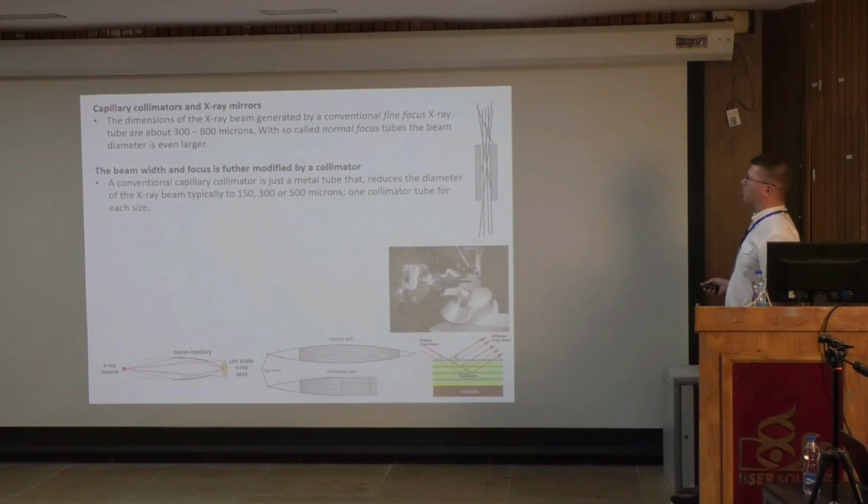But then the other one is that you can also do a new technique. You can use mirrors and collimators like this. So here the X-rays are coming from that side. Now, by moving and changing the spatial orientation of these two things here, they will also diffract, but they can diffract so that the radiation never comes out.